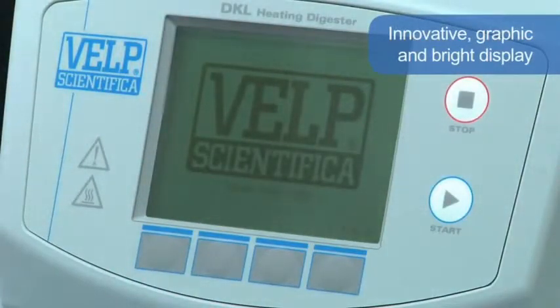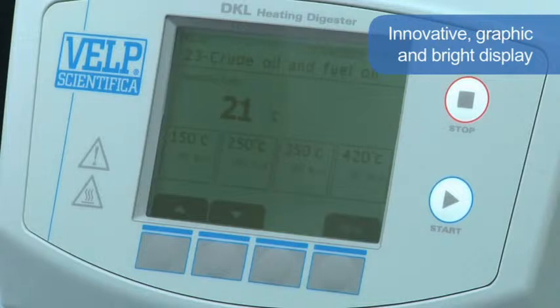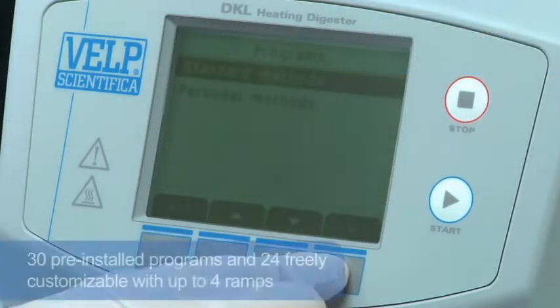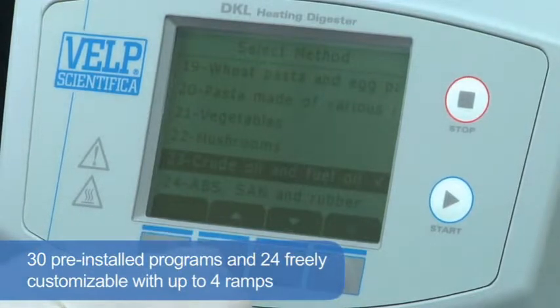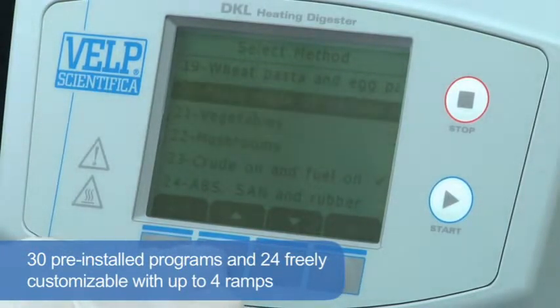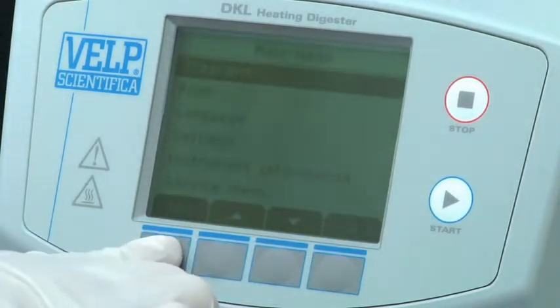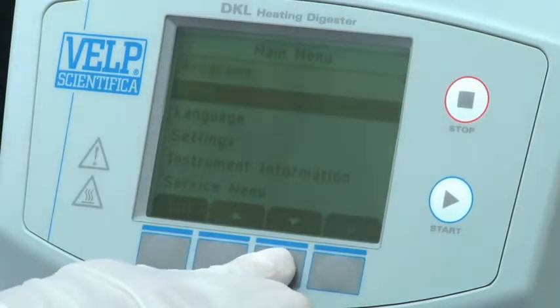An innovative graphic and bright display guides the user in a simple and fast way, planning and monitoring the various digestion phases. A 30-program library is pre-installed according to the most common applications. 24 programs can be freely customised with up to 4 ramps for digestion of particular samples. Understanding is improved by the selection of the user's own language.